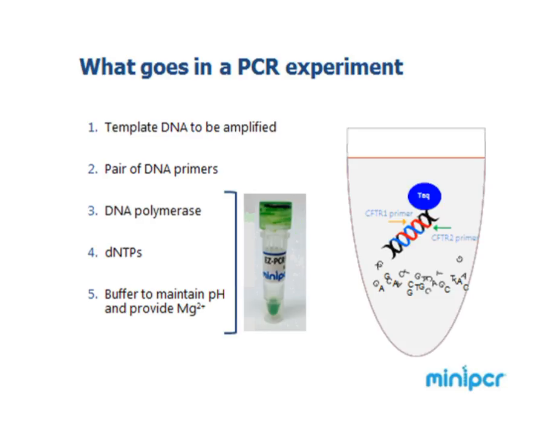Okay, so A, B, H, and D are going to have your DNA template. You're going to have your DNA primers, which are where the DNA polymerase is going to attach at specific regions of the template DNA. You'll have DNA polymerase, some nucleotides, so A's, T's, C's, and G's, and a buffer that contains magnesium ions as well as its ability to maintain your pH during this reaction. Now these 3, as mentioned right here, this is called a master mix. So all 3 of those things are in the master mix solution in the appropriate amounts.